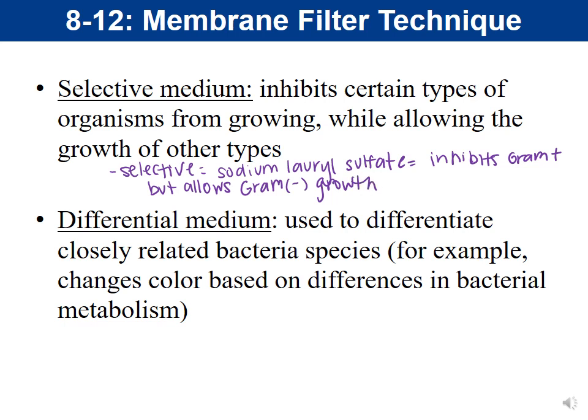That ingredient in the media we would call selective, because the sodium lauryl sulfate inhibits gram-positive but allows for gram-negative growth. And again, that makes sense because in our coliform test, we're trying to detect gram-negative bacteria.